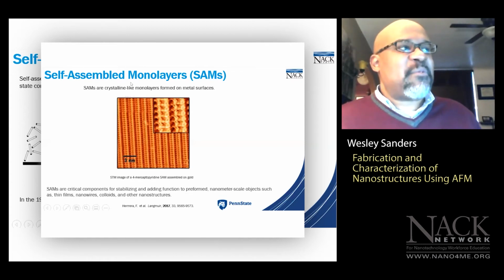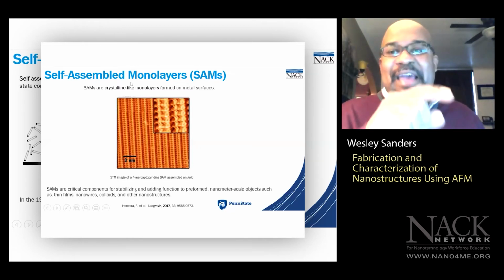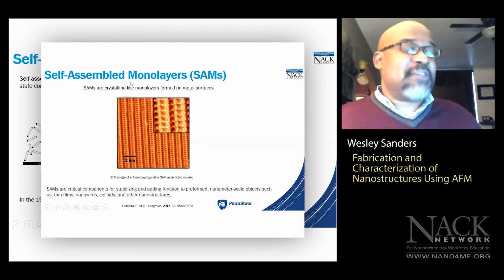That works to our advantage because the tight, well-organized arrangement that we see in self-assembled monolayers will provide us with an opportunity to produce really high-resolution patterns that we can etch using our scanning atomic force microscope tip.